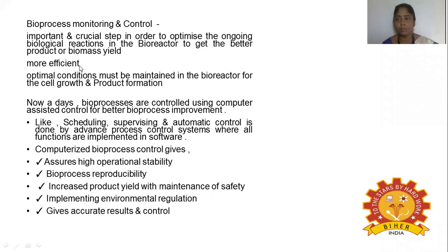It also speaks about a more efficient process, and it has to give maximum product formation. When we look at monitoring and controlling, it cannot be done in a manual way if it is carried out at a large pilot scale, right? So here we use computer-assisted programming for better bioprocess improvement.